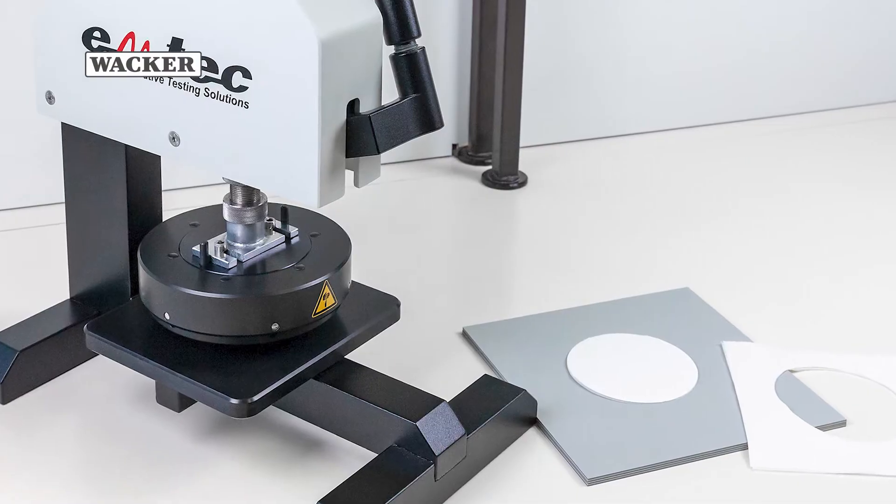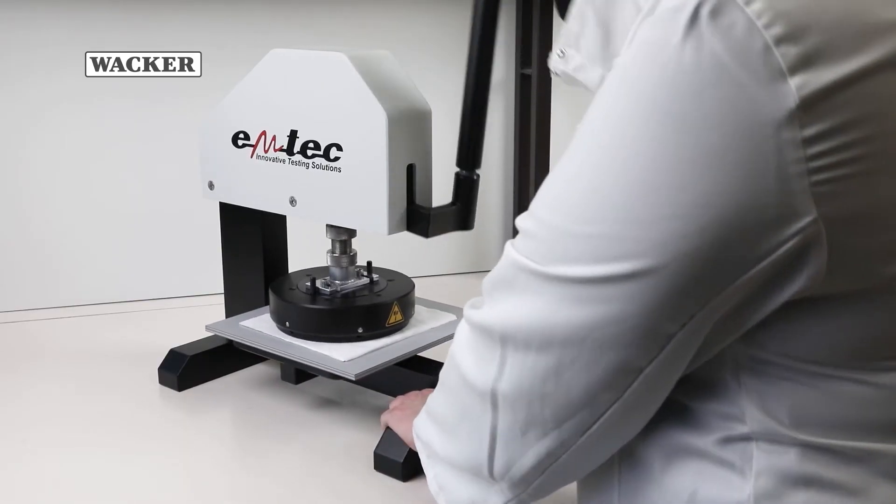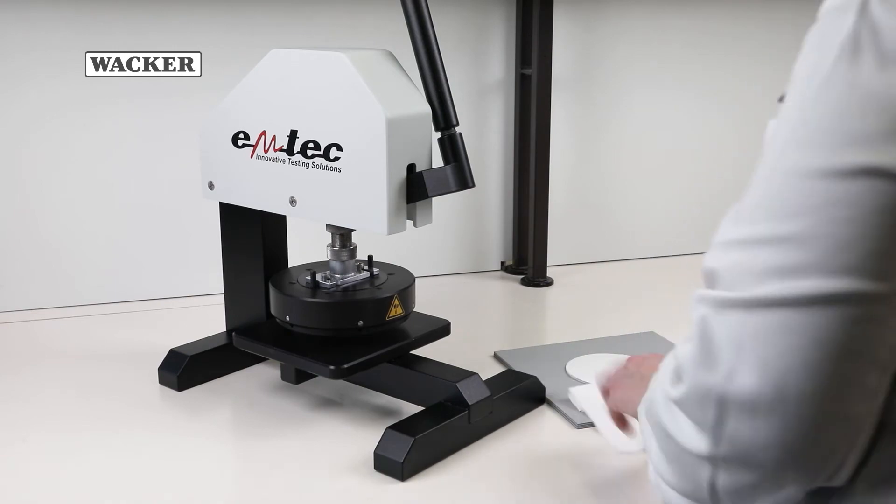For the sample preparation, the tissues are cut into 100 square centimeter circular pieces with a sample punch.